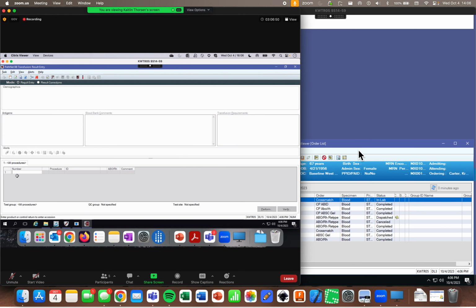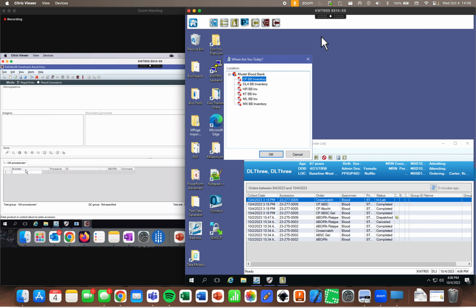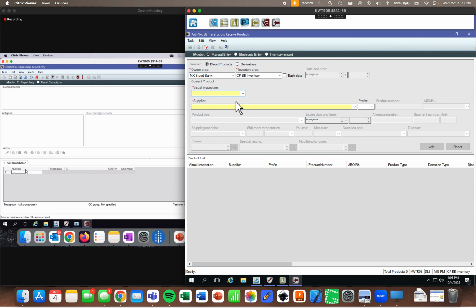So if I have my cursor, see, look at my little cursor there in my product number box, and then hold down the control key on my keyboard and hit the enter key. Hey, look at that. Now it's got my accession number format. Fancy.